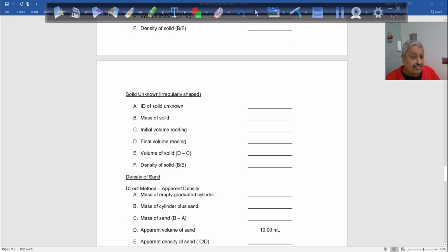So now this one here for the irregular shape, those are the crooked spheres. I call them crooked spheres. As you can see, they are not per se spheres. They are really crooked spheres. But if they are made spheres, they can be used by hunting guns, whatever. They are not deadly. The aluminum, they are light, therefore not deadly. The real shots, they are heavy, so they can be made with copper, lead, very heavy. So the irregular shape, those are shots, and my suspicion is aluminum.